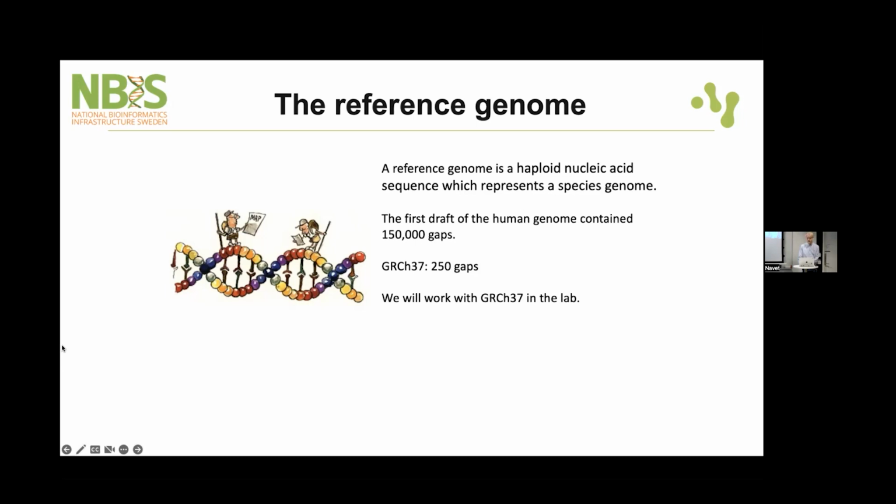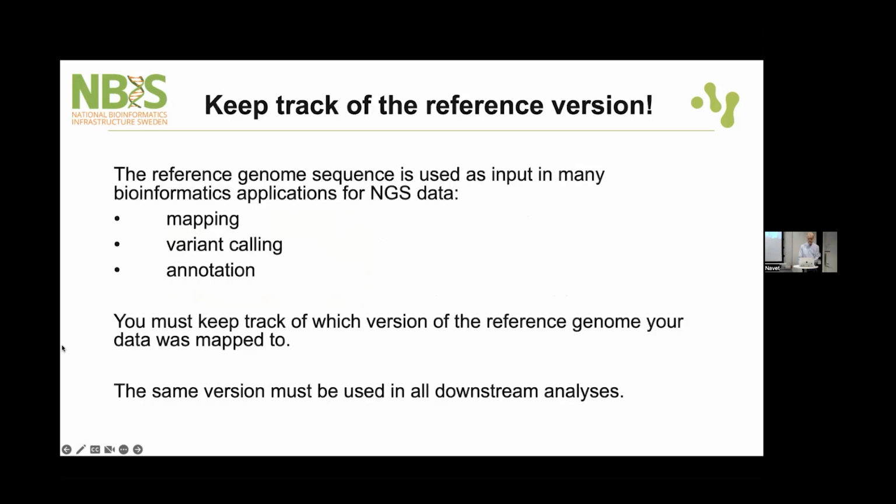But I would say it's more likely than not that you will use a more recent version of the reference genome if you perform these steps on your own data. And make sure you know which reference genome is being used with your data. If you get data that's already been mapped to the reference genome, for example, you will need to make sure that you maintain the same version of the reference genome in subsequent steps of your analysis, or you will end up having a lot of errors.